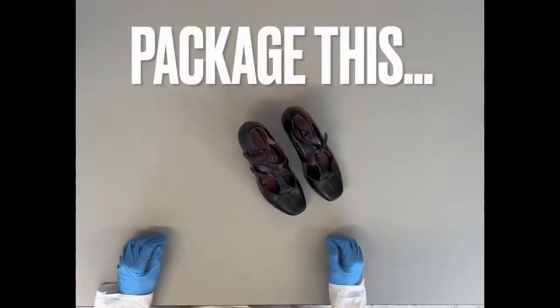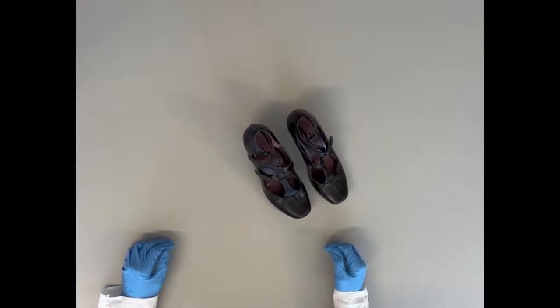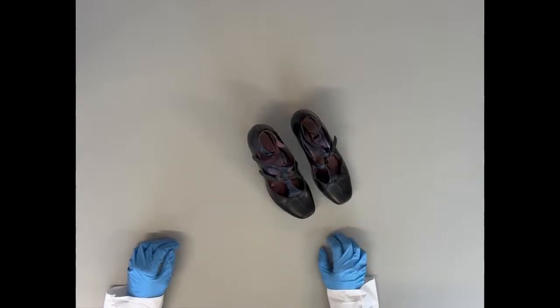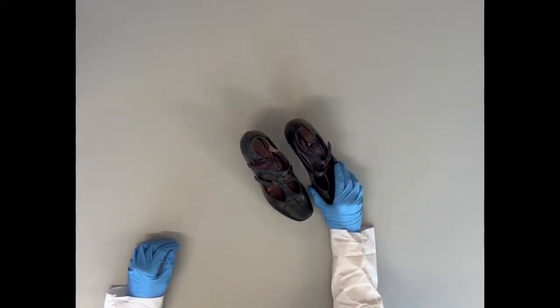Hello and welcome to another episode of Package This at the North Louisiana Crime Lab. Today we are going to be showing you how to properly package shoes for DNA analysis. We test shoes at the NLCL for both the wearer's DNA as well as potential DNA from the soles or outer surfaces, like if the suspect stepped in the victim's blood.